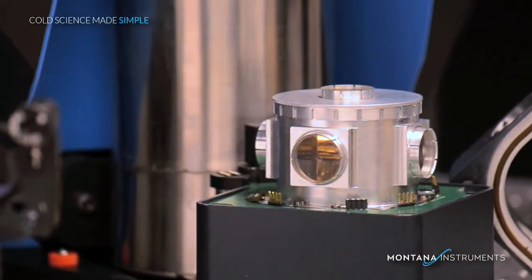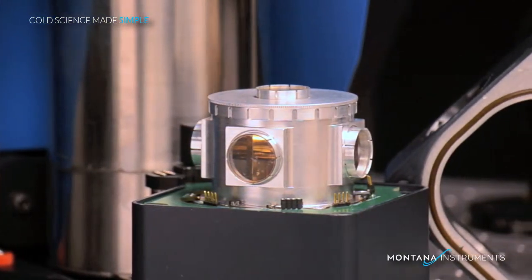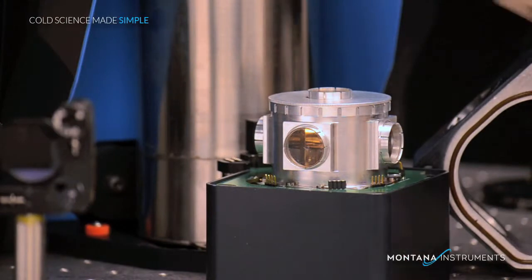Now you can see the inner radiation shield with its radiation blocking windows. During operation, this stage is cooled to about 30 degrees Kelvin. Each of these windows can be adjusted or removed for closed working distance microscopy applications.